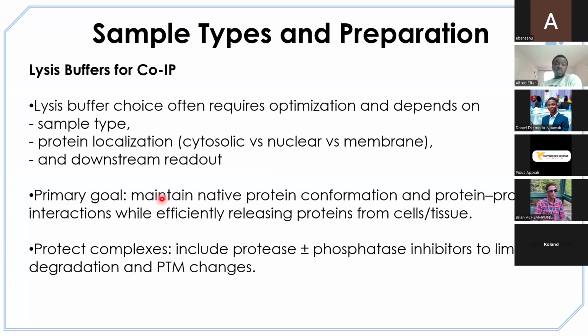Now, the main goal of whatever we are doing here is to maintain the native protein conformation and then the protein-protein interaction. So, you know, proteins, they have their individual properties.